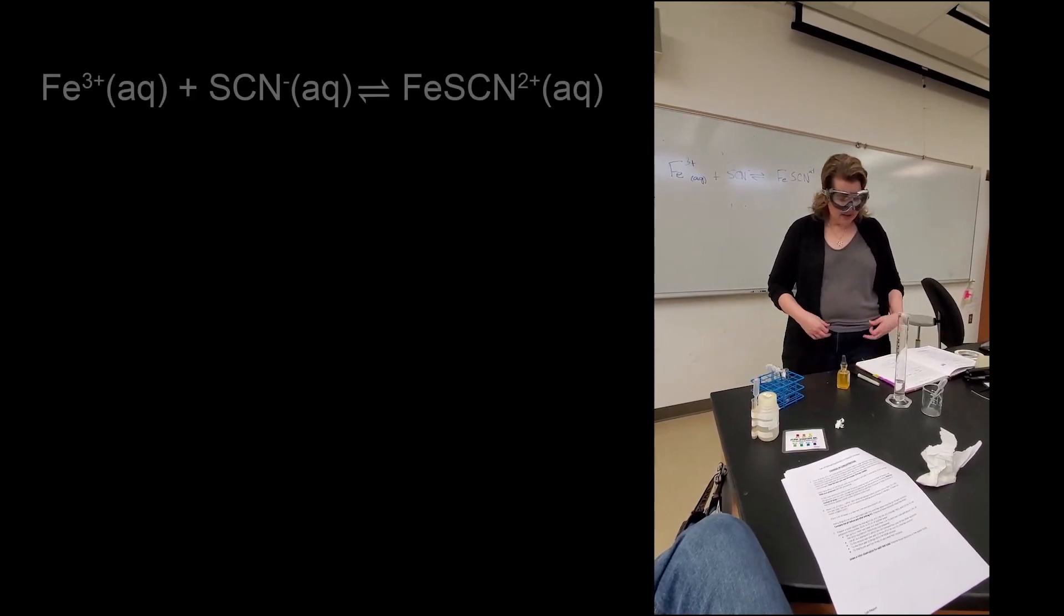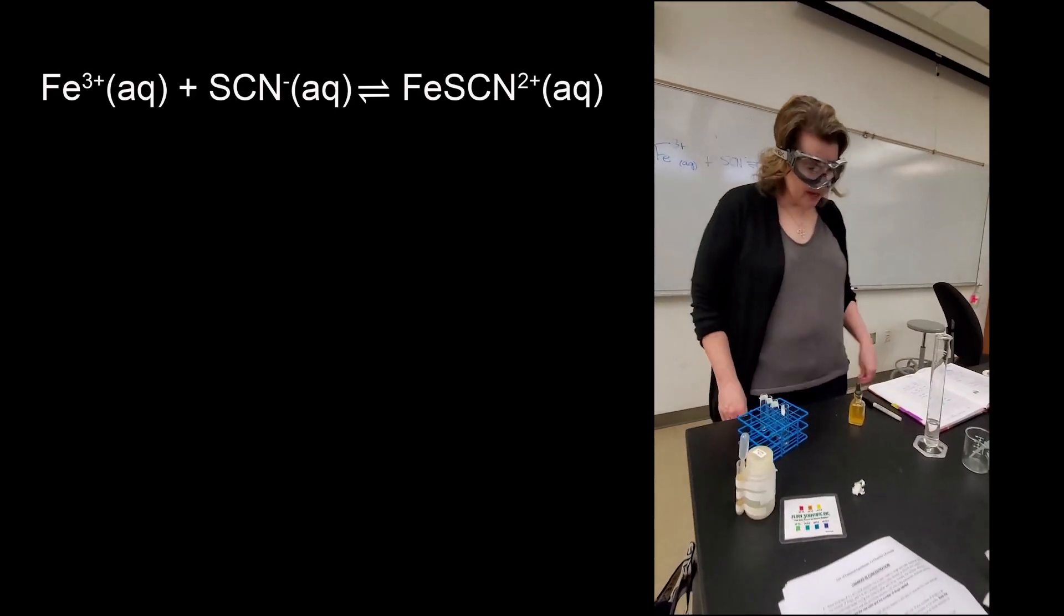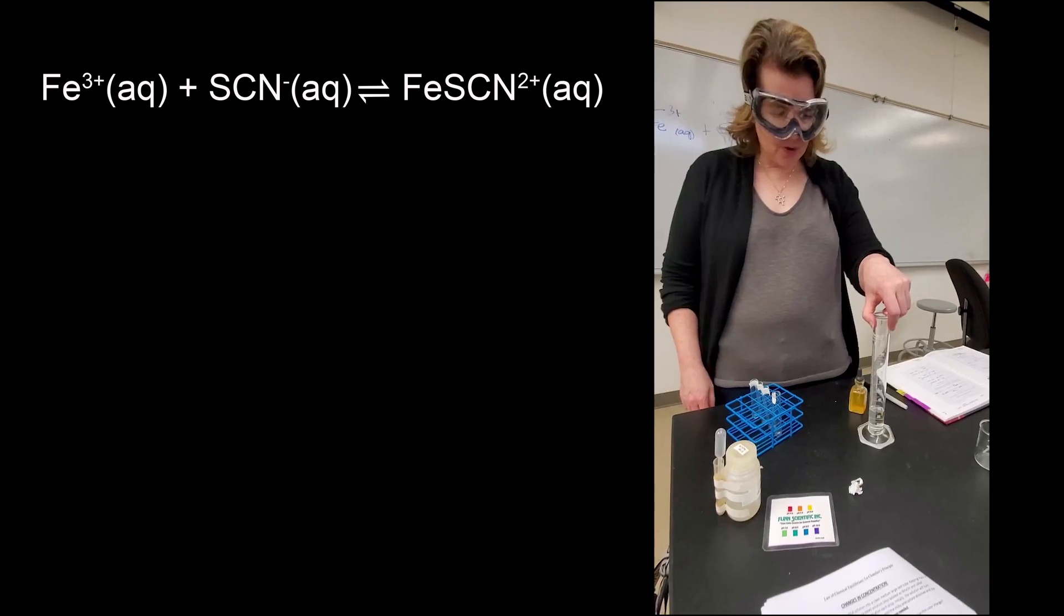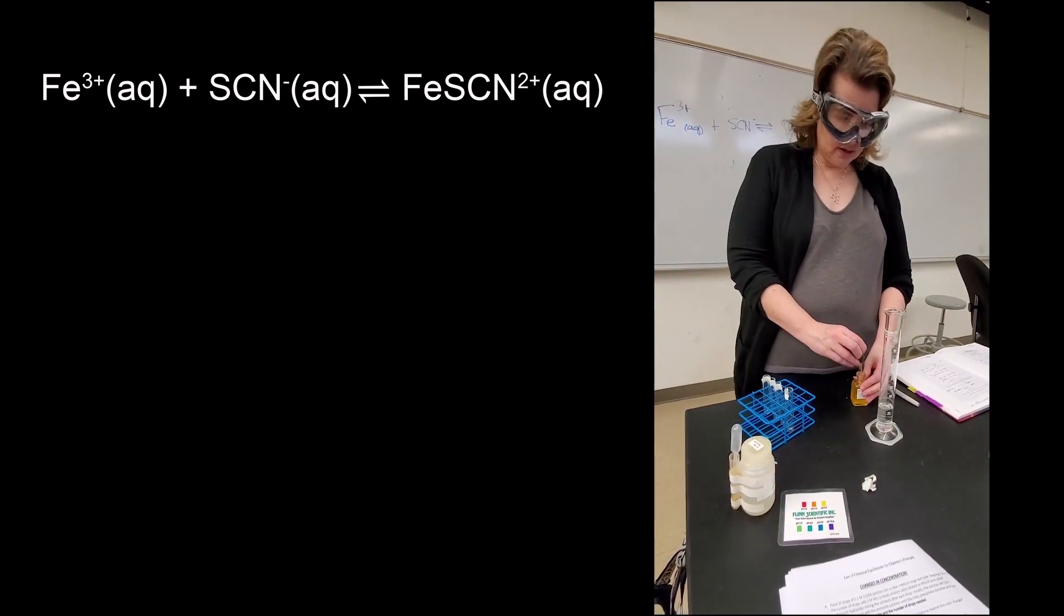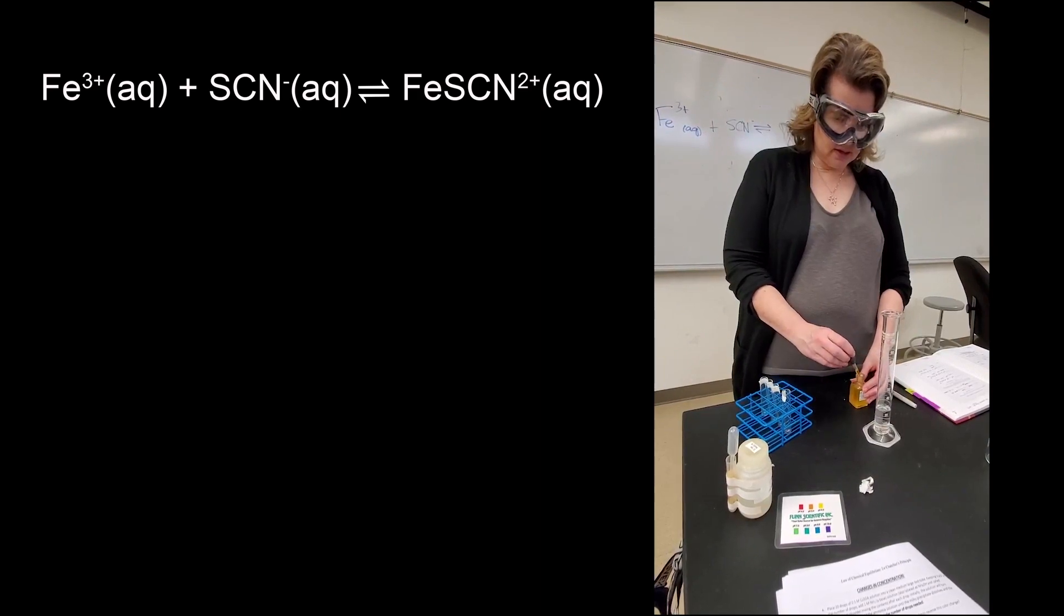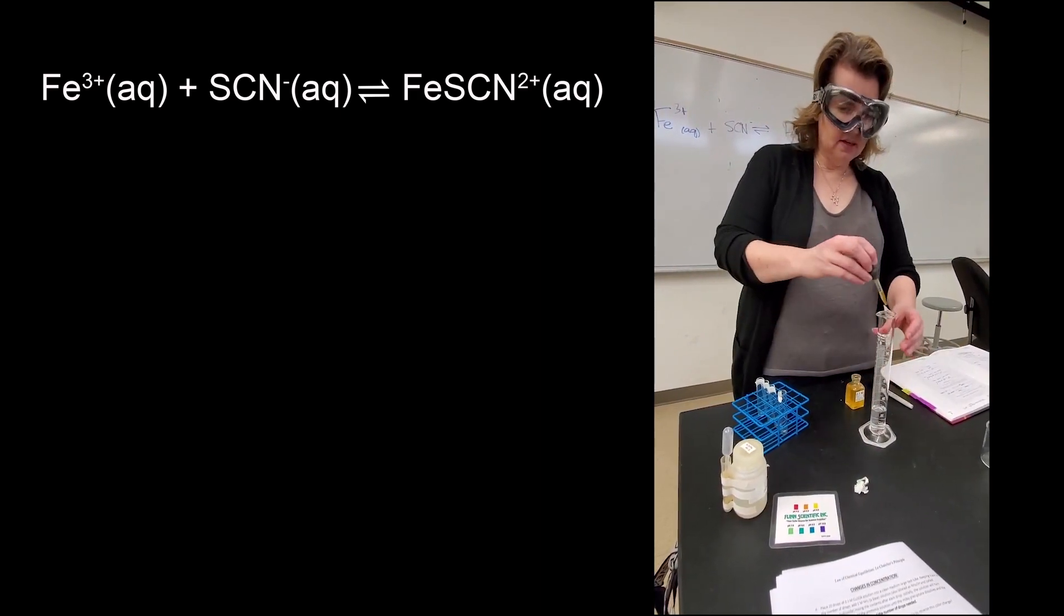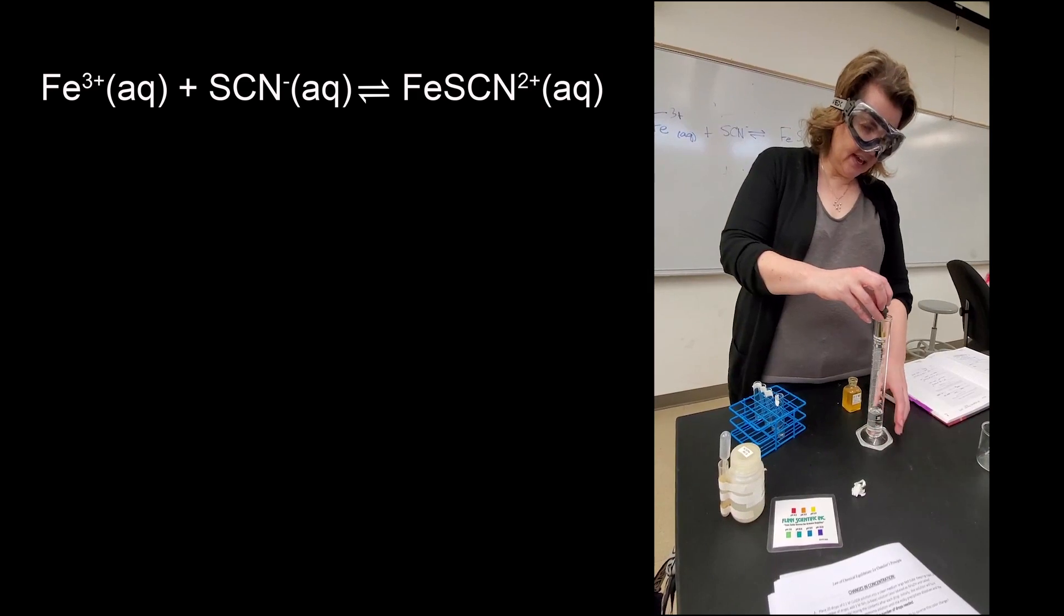So Morgan, this one starts with having us make up a stock solution. Can you tell me what, I already have the 25 milliliters of water. What do I need to put in this? You have your stock solution. You're going to mix in 25 mils of water, half a mil of 0.1 molar iron 3 chloride. Okay, that's good.